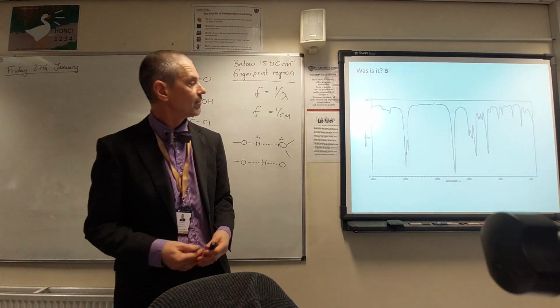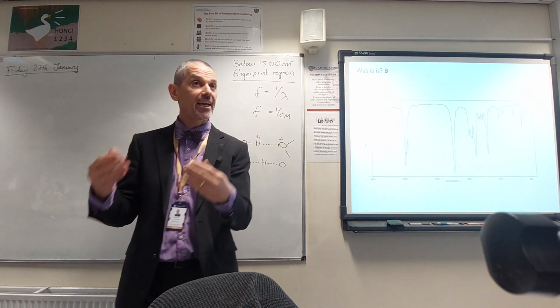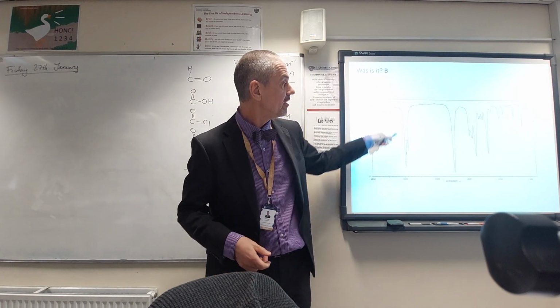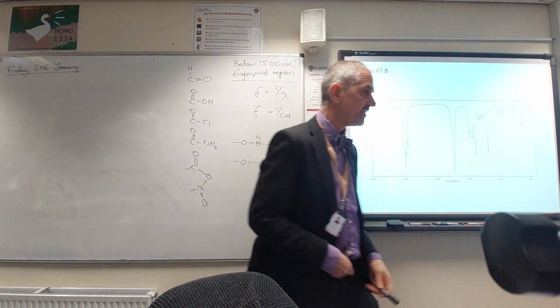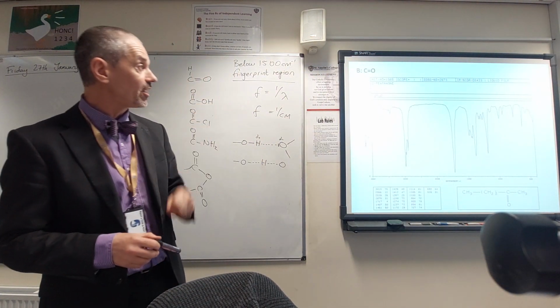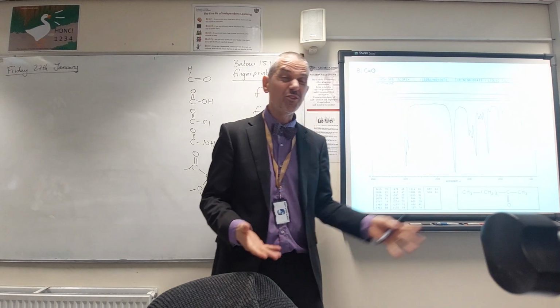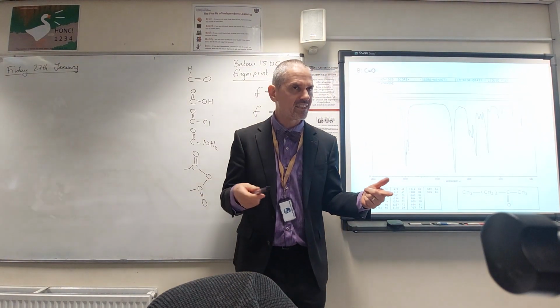What's B? I've seen B already, but it doesn't really matter. It's a carbonyl. And again, you can't be more specific than that. It could be an aldehyde, it could be a ketone. It can't be an acid, of course, because we don't have a peak over here, although it does look like it got a bit wet. But it's definitely a carbonyl. And we can't be more specific than that. So that was pentanone, pentan-2-one. Yeah, and if that's all the information you need to get from that, that will probably help you solve the problem. So you've done quite a lot of these starters.